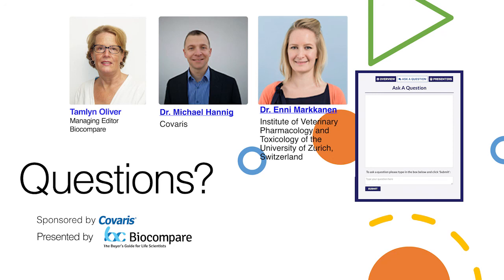Have you heard of a research group that has used this technique to do RNA-seq on organisms that have infested the skin, like leishmaniasis? I know I said that wrong. I'm sorry. Leishmaniasis. I think it's a parasite which lives in the skin. I'm not aware right now of any research group having done that, even though probably someone out there has done it, because I think that's exactly a good technique to use for those kinds of questions. So I really don't see why it shouldn't work.